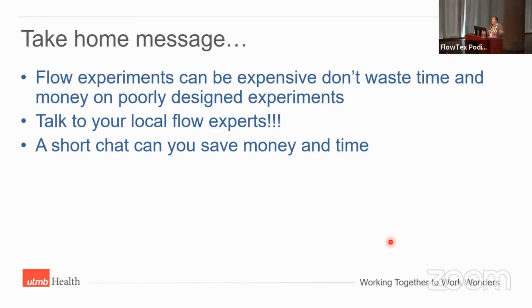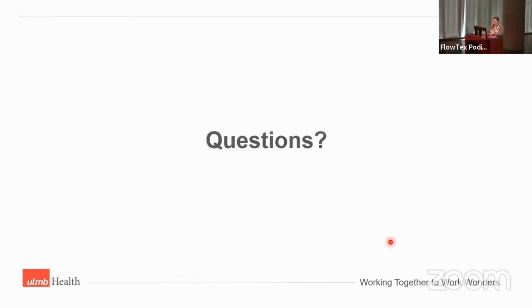This panel was redesigned in about 15 minutes. It doesn't have to be a 30-minute to a 6-hour conversation. With some of the smaller experiments, those data can be improved. It doesn't have to be an 18+ color panel for you to talk to your flow people. So please use us as a resource. We are here for you. Even if you think that you have a flow expert in the lab, this lab did have a flow expert. So yes, that's my take home message. I think I talked really fast, but if you have any questions, I'm happy to take them.